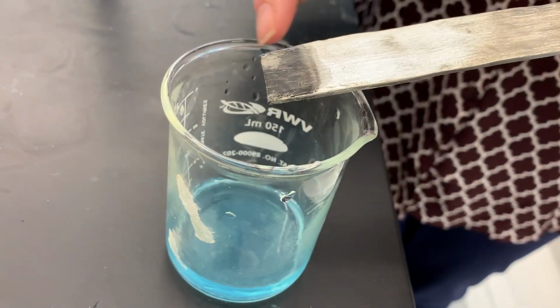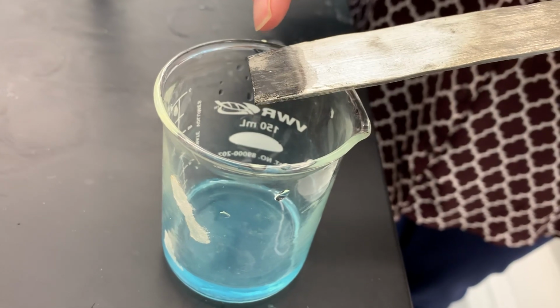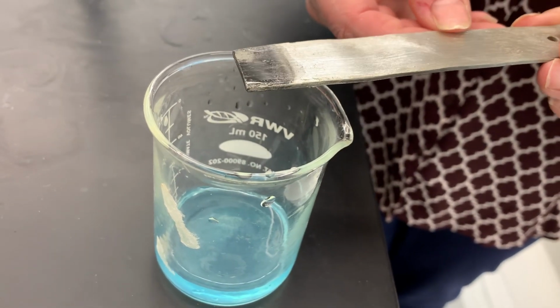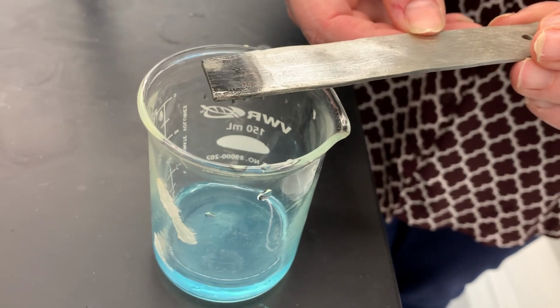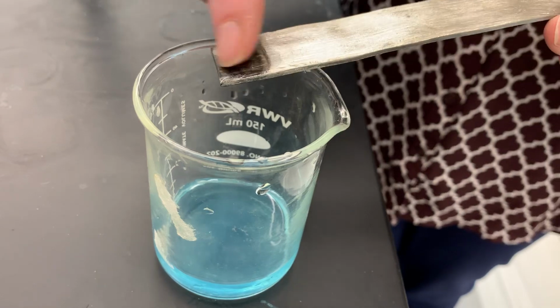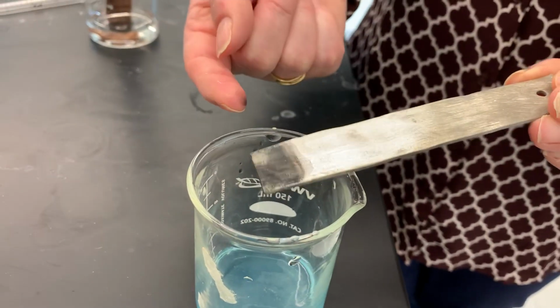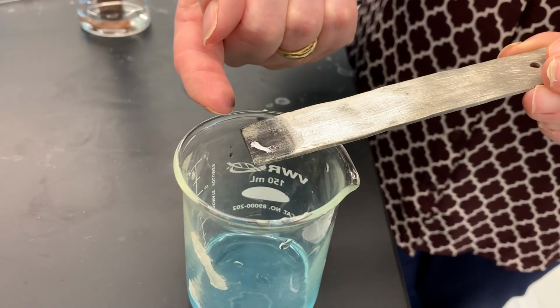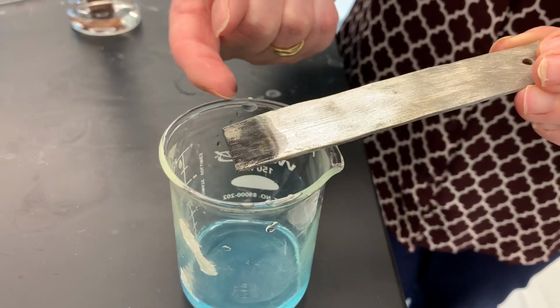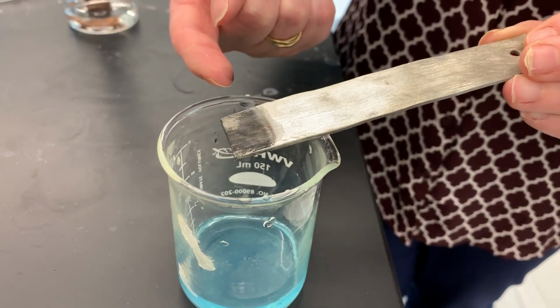And this bottom portion, which was immersed in a solution of copper sulfate, you can see it's now completely different in appearance. It appears black, and there's this black powder-like material, which I rubbed on my finger a little bit to show you. So here in this beaker, there is an apparent sign of reaction.